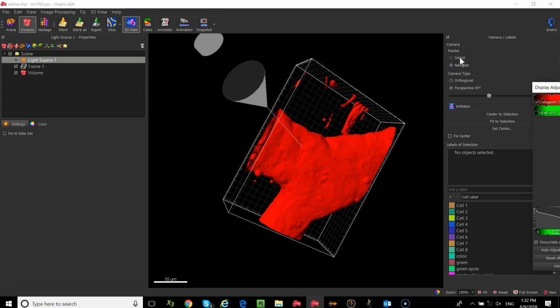You're going to find that you're going to switch between those two modes all day, every day when you use Imaris. So having to go over and click on something is kind of tedious. So there is a shortcut for it, and when you start using Imaris, you'll find that you'll have one hand on the mouse. You're going to have the other finger on the escape key, okay? The escape key is the shortcut between navigate and select. And as you tap the escape key, you'll notice that the icon on your screen will change from a pointer to a double arrow. The double arrow is the navigate, and the single arrow is select mode, okay?